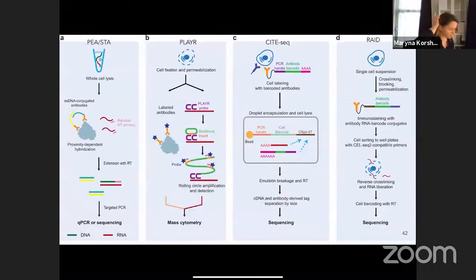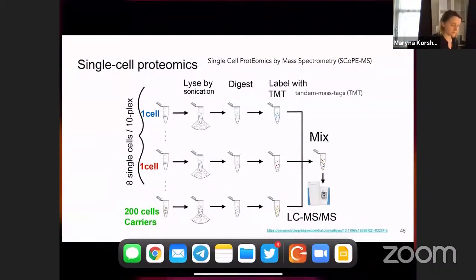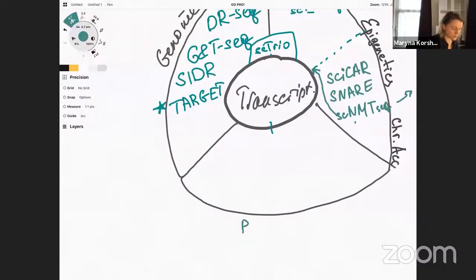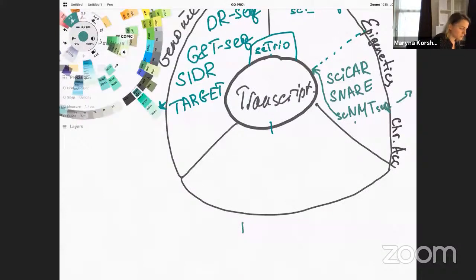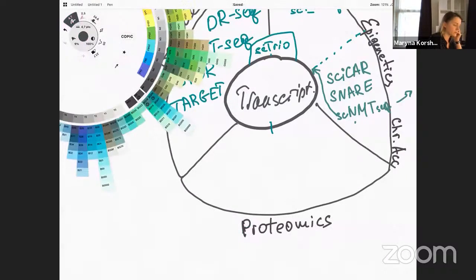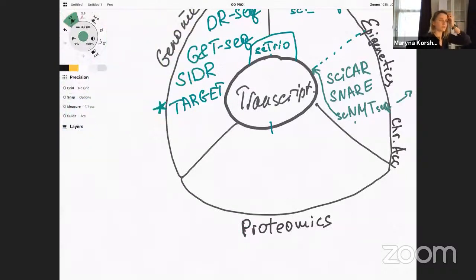The last method and the last set of multi-omics analysis that I would briefly highlight is related to measurement of both transcriptomics and proteomics. And to do this, you might guess that you will apply such reagents as antibodies. Why do this with antibodies is that you can conjugate them with different oligonucleotides in order to be able to correspond this particular type of antibody with this oligonucleotide.